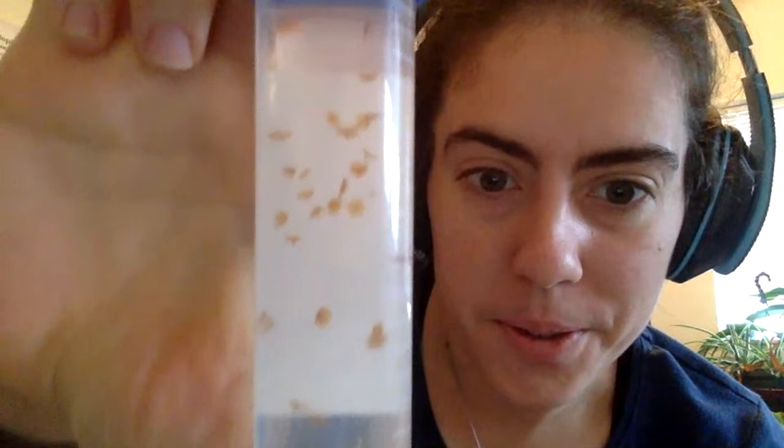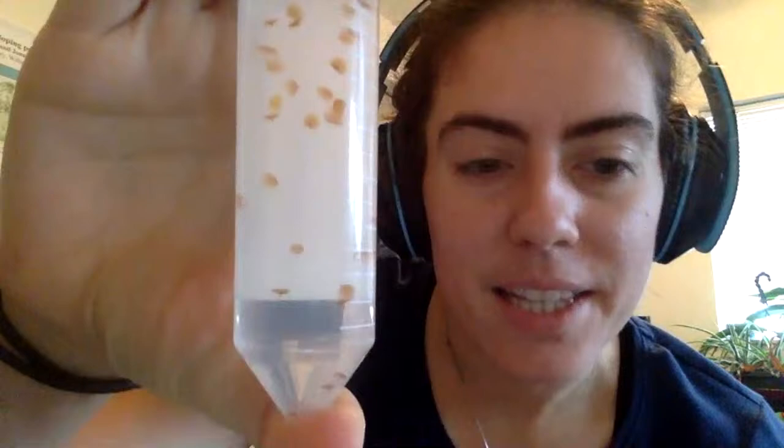And then the other tank I moved over here — these are ephyra. These are really small jellies, probably only about a day old. This species is called Sanderia malanensis; it's related to sea nettles. Eventually the bell will probably be about this big and the tentacles could be about this long. But for right now they're just very tiny and cute. They don't really have full tentacles yet, but they do have a mouth, so we'll probably start feeding them soon.